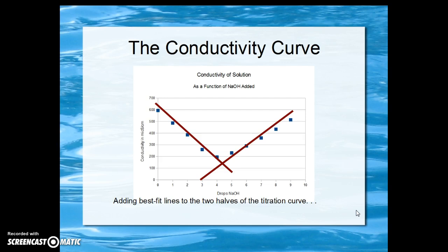And this gives us the conductivity curve. The decline here as sodium hydroxide neutralizes the hydrogen ions. And the increase here as unneutralized sodium hydroxide is added to the solution.